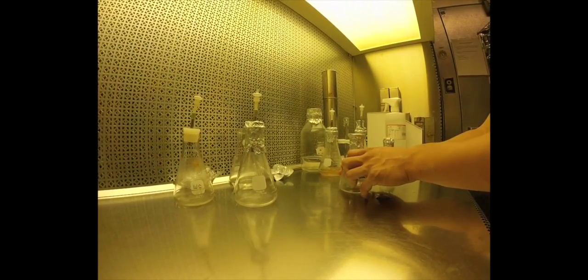And so now we can open the flask containing the inoculum and transfer. I usually do 10 to 20% inoculation depending on the density of the inoculum. Here we're going to do around 10%.